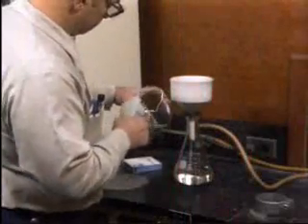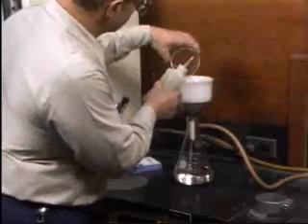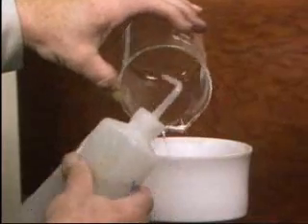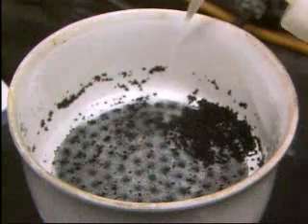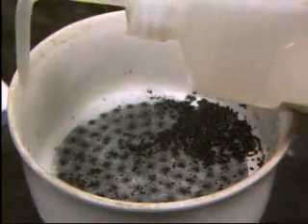After the sample is drained, the beaker is rinsed, and the rinsed liquid is poured into the funnel to remove any remaining solids from the beaker. In this example, distilled water is used to rinse the beaker. However, some samples may have to be rinsed with a different liquid. Next, the funnel assembly is rinsed to wash the solids from the wall of the funnel and ensure that all of the solids have collected on the filter paper.